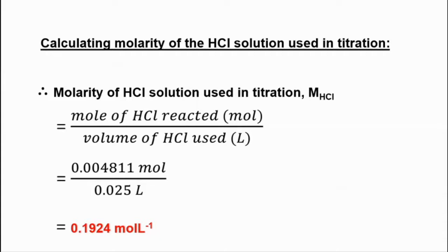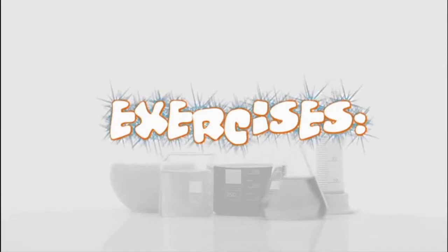So this is the molarity of the hydrochloric acid solution used in this titration, and we have successfully determined the concentration of this hydrochloric acid. Alright, good job, guys.